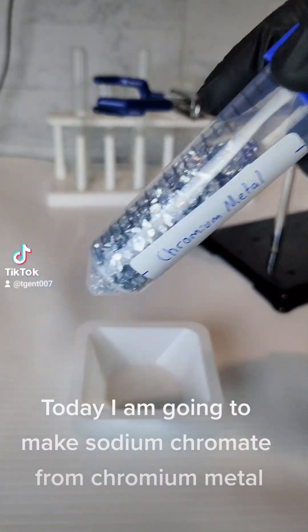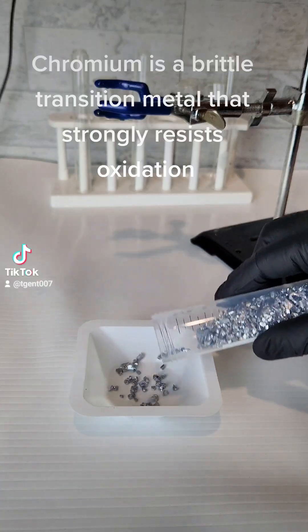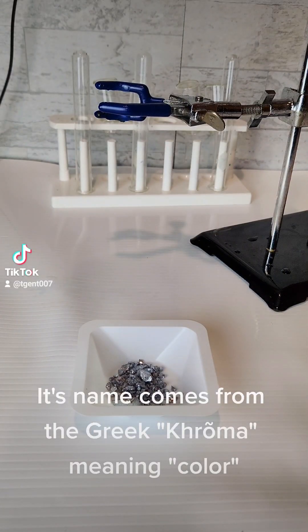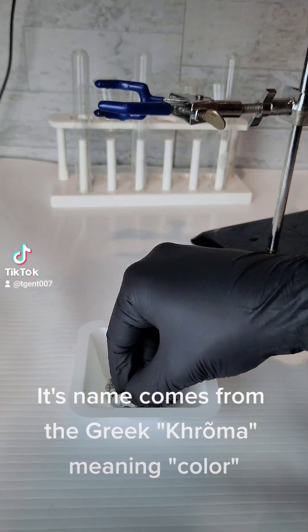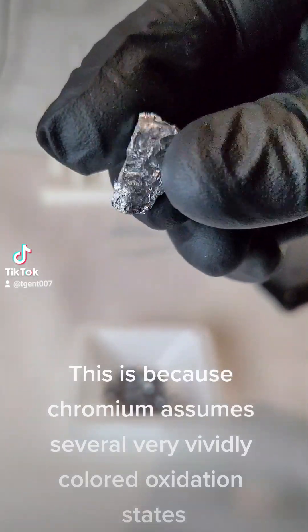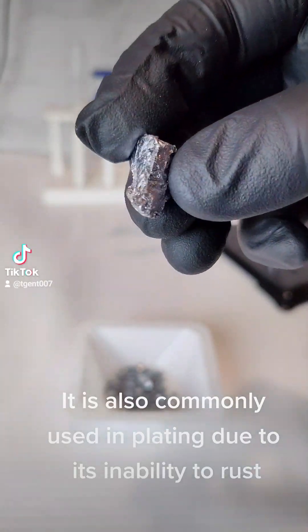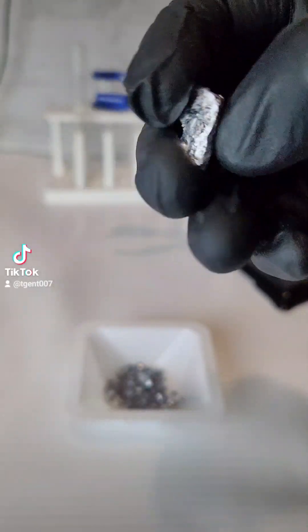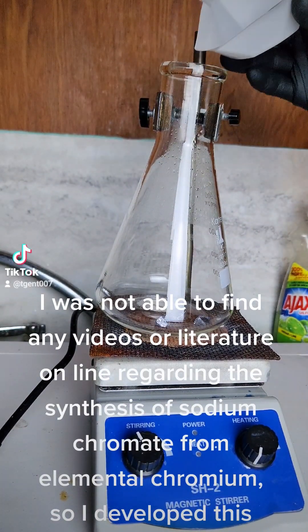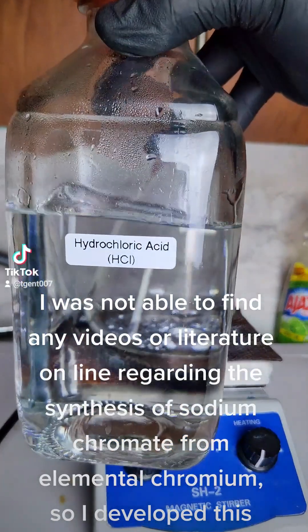Today I am going to make sodium chromate from chromium metal. Chromium is a brittle transition metal that strongly resists oxidation. Its name comes from the Greek chroma meaning color, because chromium assumes several very vividly colored oxidation states. It is also commonly used in plating due to its inability to rust. I was not able to find any videos or literature online regarding the synthesis of sodium chromate from elemental chromium, so I developed this process on my own.